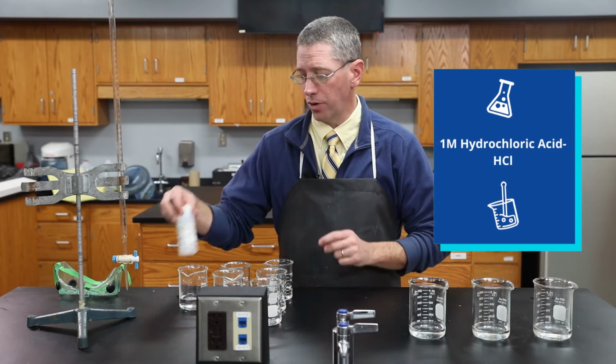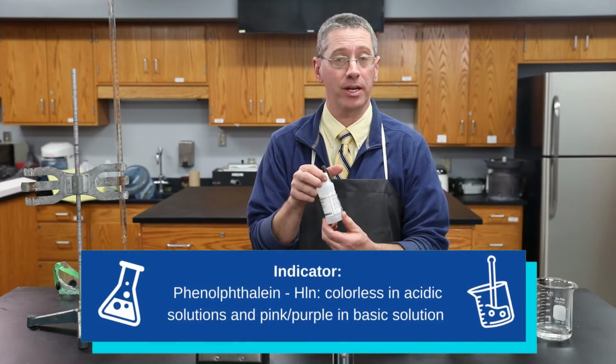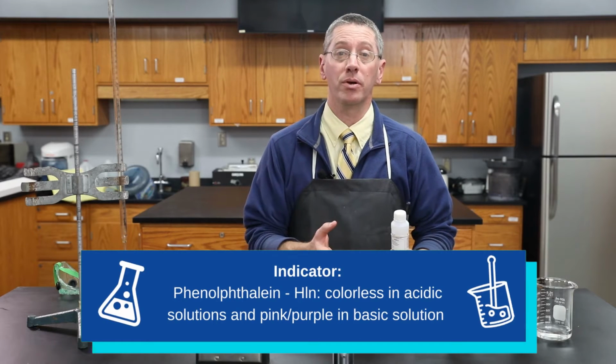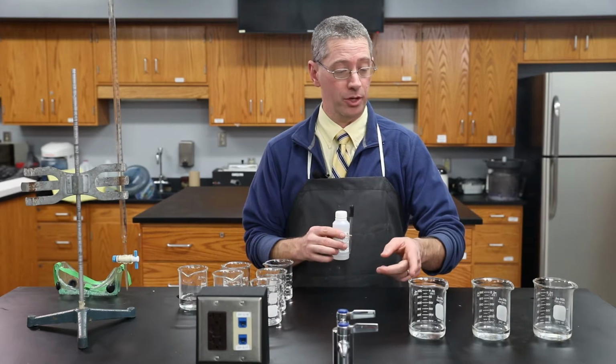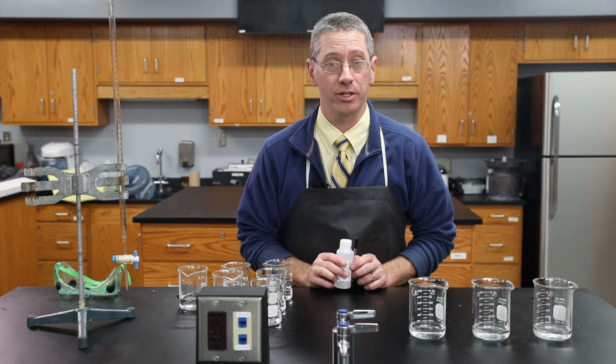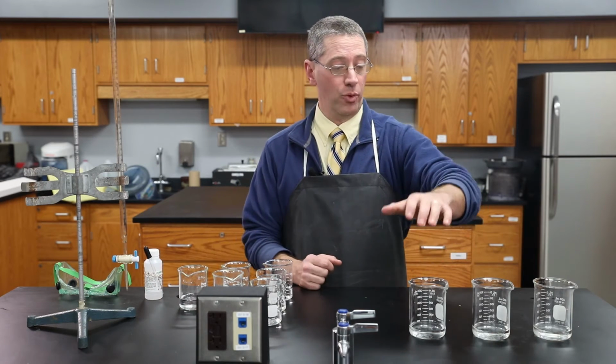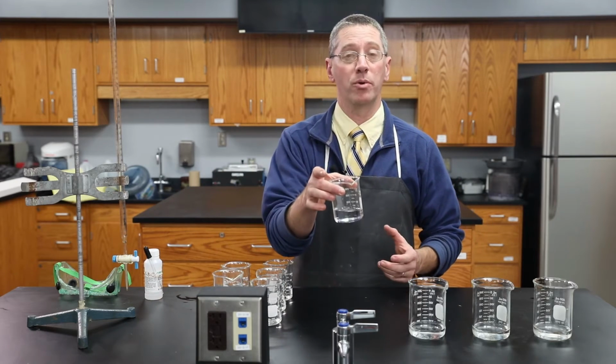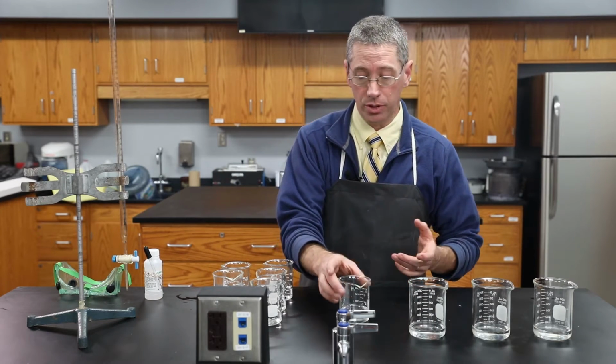I've also added a few drops of an indicator called phenolphthalein to the acid. It's clear in acidic solutions but turns purple in basic solutions, so we'll be able to know exactly when we reach the neutralization point. Now, if we have 1 molarity base here, it should be neutralized with an equal amount of 1 molarity acid. And that's what we're going to do first.